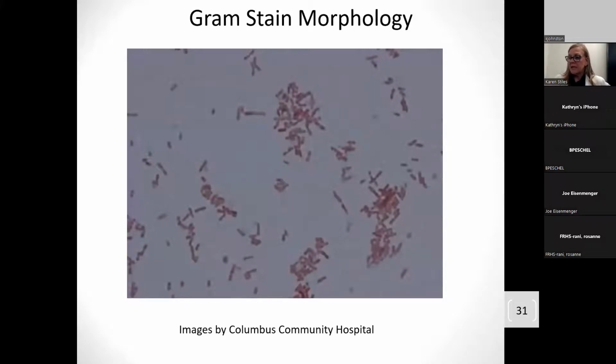Now, I have a gram stain from a previous exercise, so I did save that. It looks like this. I apologize, it's a little dark. Something had been taken with our stat pack. And on the stat pack, you can play with exposure and make that a little lighter if it's hard to read. But you see that some of these organisms are very definitely rod shaped. Now some of them are not. Some of them are maybe a little bit rounder than you would like, but let's look at it as a picture as a whole. It's pretty much all gram negative rods.